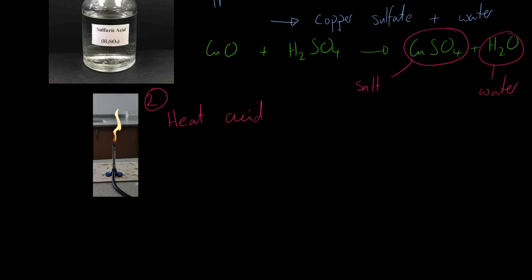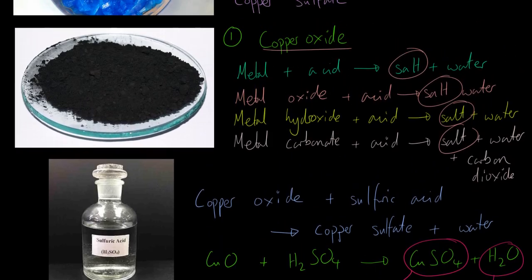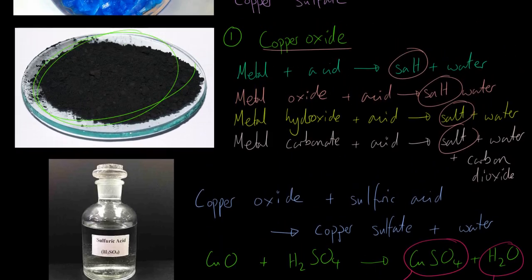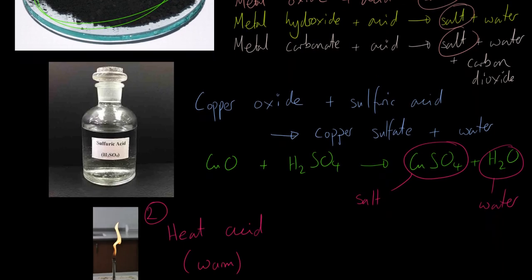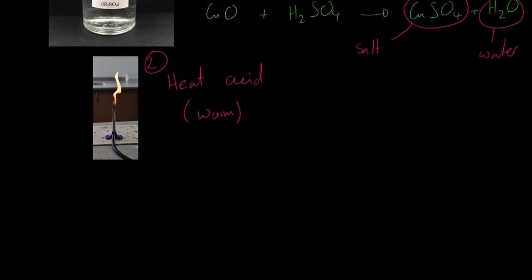Okay, not very much - I should say you warm the acid. Acids tend to give off quite unpleasant vapors if you heat them too strongly, so you're warming it just to encourage the reaction along. Once you've warmed up your sulfuric acid, you can start stirring in your copper oxide, and you will notice that it starts turning a lovely blue color. You are producing copper sulfate.